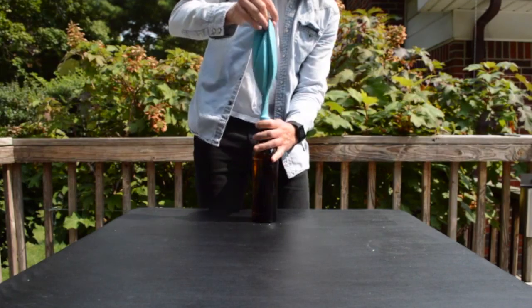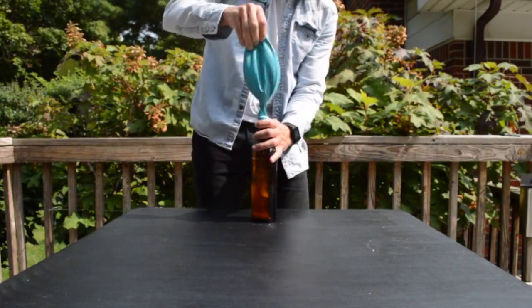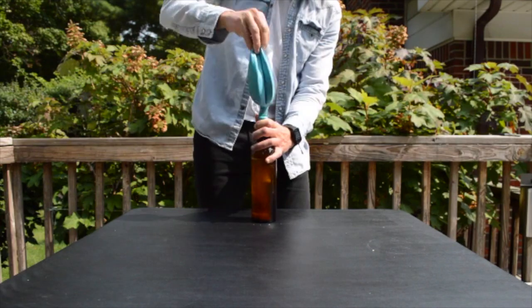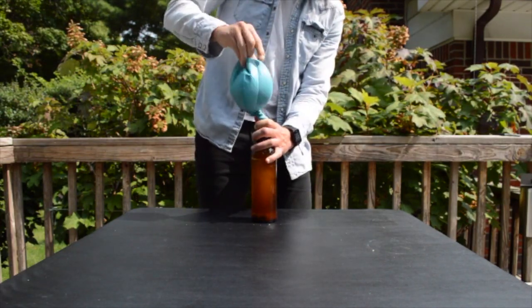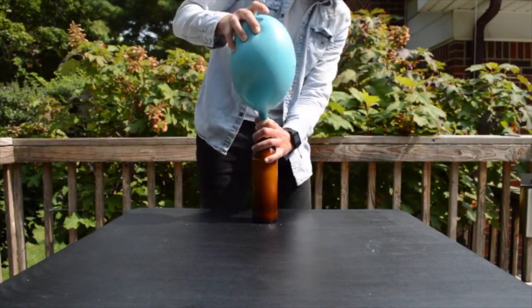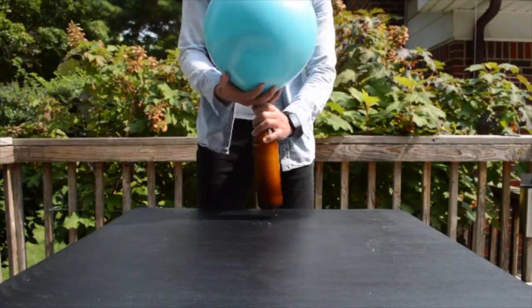If your balloon doesn't create a good seal, you can use an elastic band to create a better seal. It will probably bubble a lot and some of the vinegar might go up into the balloon. But that's okay because as the reaction slows down, it'll all drop back into the bottle.